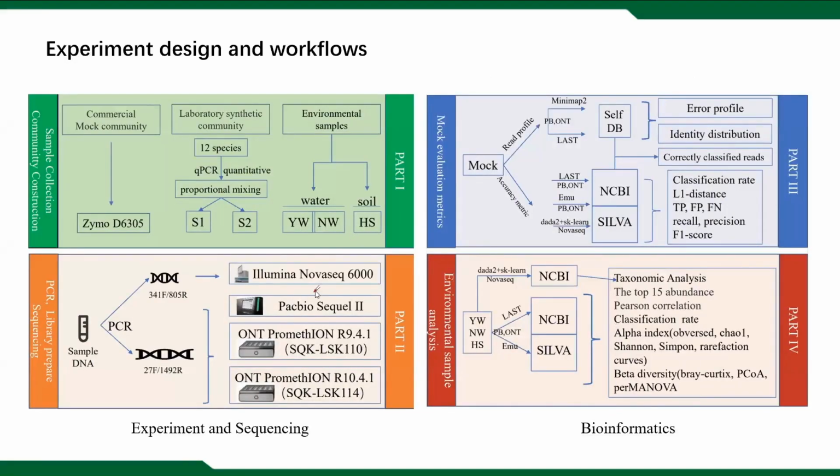In the current research work, using a custom workflow, NovaSeq, PacBio, Nanopore R9 and Nanopore R10.4.1 16S ribosomal RNA sequencing were performed on the Zymo and synthetic communities. To evaluate the taxonomic assignments, LAST and Emu for long reads and DADA2 for NovaSeq classification tools were compared using the NCBI and Silva databases.